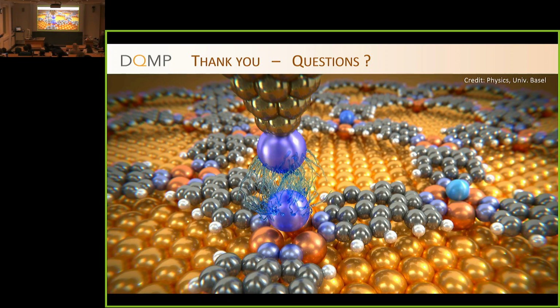This happens, and the thing I showed you with the spin resolution on the iron telluride, that's exactly what happened. Initially it was an annoyance until they realized they had actually reproduced a spin-polarized tip. Do you have to change the whole tip? Not necessarily. They will be able to tell you much better, but usually these tips are conditioned on gold or silver until you get a spectrum that you like. These have a surface state, so you make sure you have some imaging resolution and some spectroscopy. If a tip goes bad, you can go back on gold, and about 5 times out of 10 you recover it. So there is a way to recover.